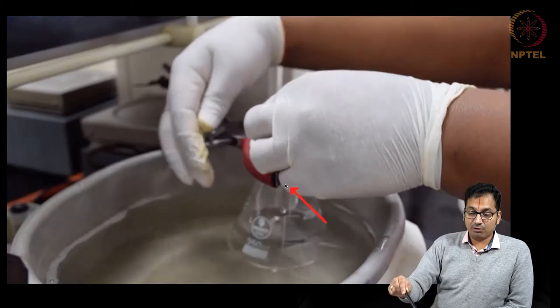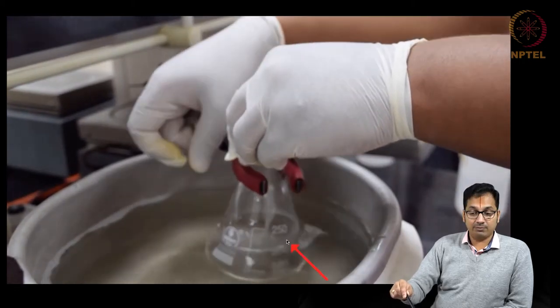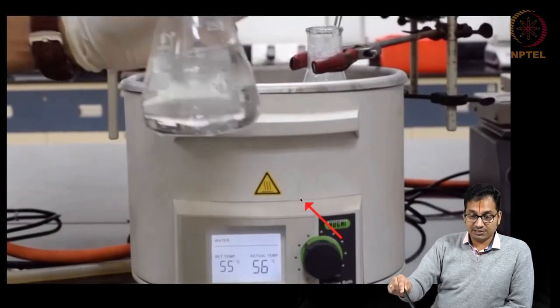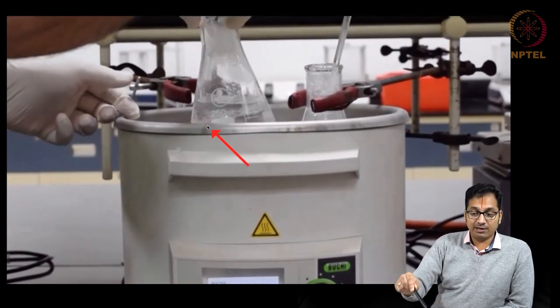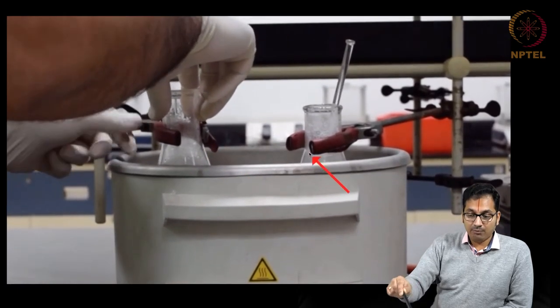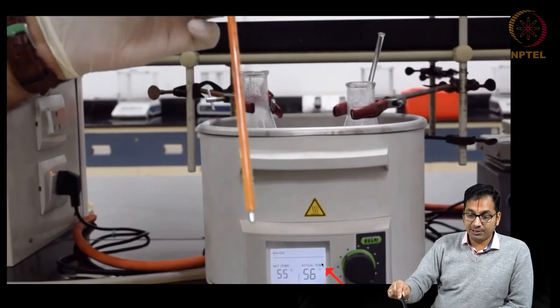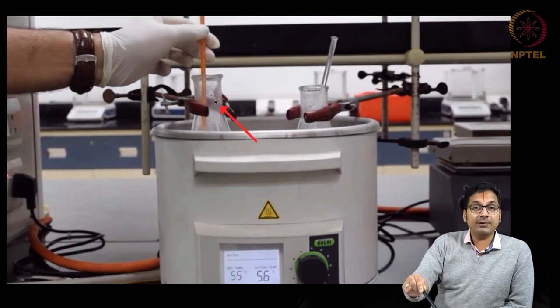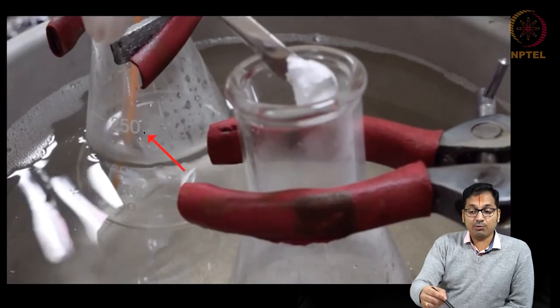Here we are able to see the conical flask that has 200 ml of water, to which you will be adding the solid benzoic acid, and ensure that the entire solution is immersed within the water, and use another conical flask which is also filled with about 200 ml of water, into which you will be adding your thermometer. And both these solutions have to be equilibrated in the water bath at a given temperature, and the temperature, although it is listed here, it's a better idea to have a separate measurement so as to ensure that you are actually measuring the temperature that you want to measure.